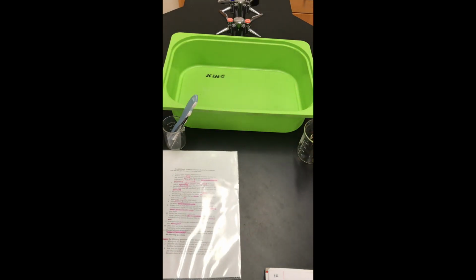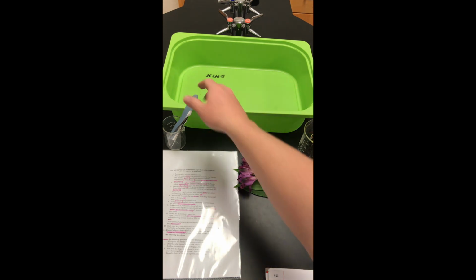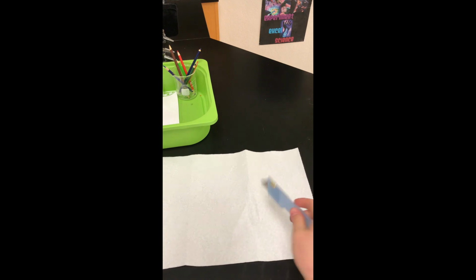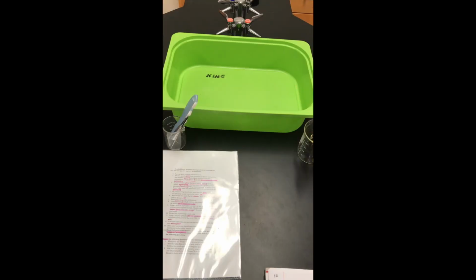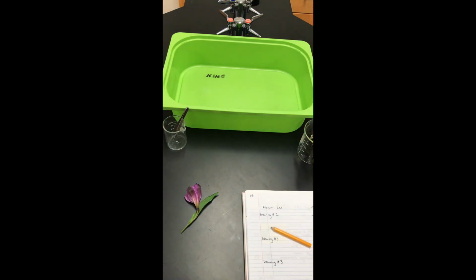Now, today's lab, you guys will have a razor blade, tweezers, colored pencils, and a set of instructions. When you guys get back there in pairs, you can grab a flower. Now, one word of caution, this X-Acto knife is very sharp. I poked myself earlier, and this is not good. So please be very careful when you're cutting the flower from the stalk.